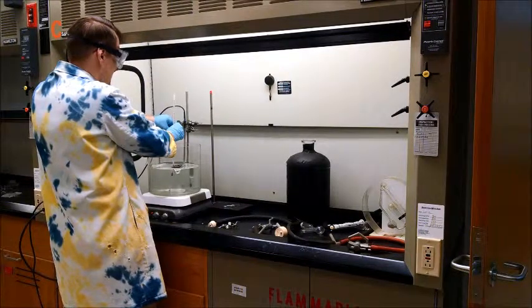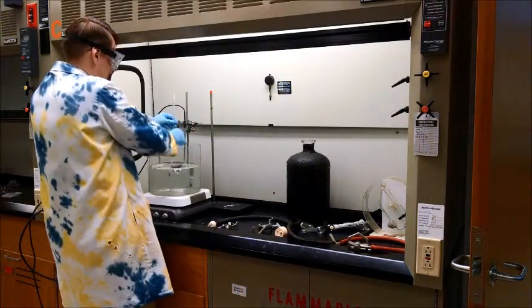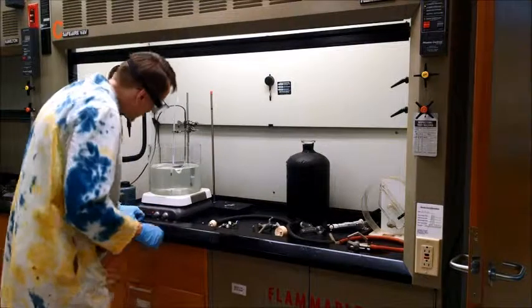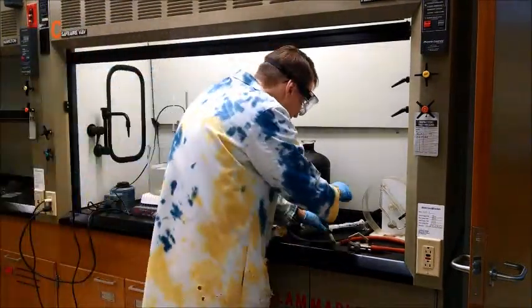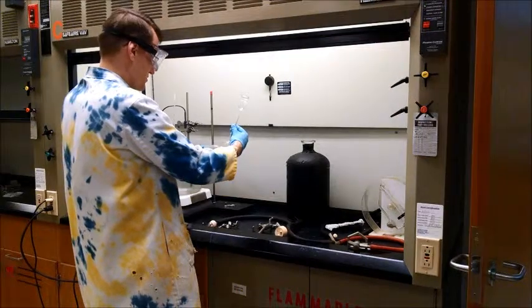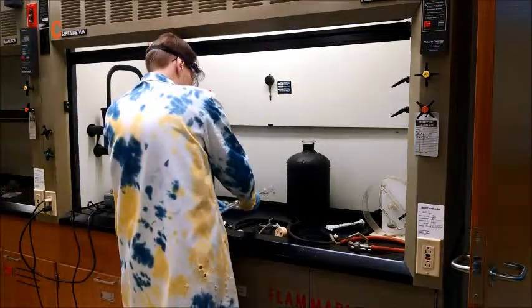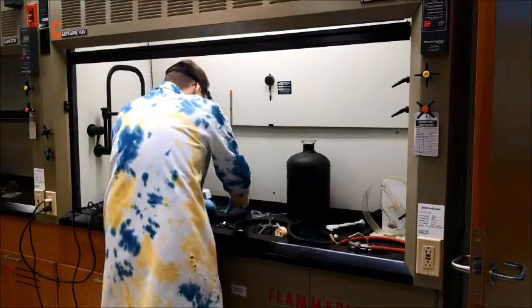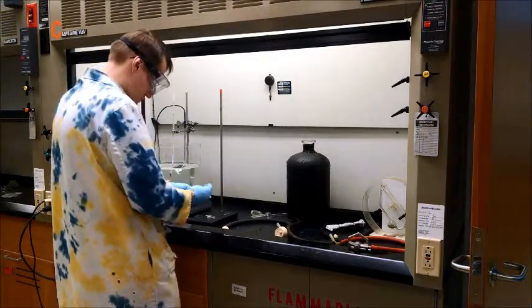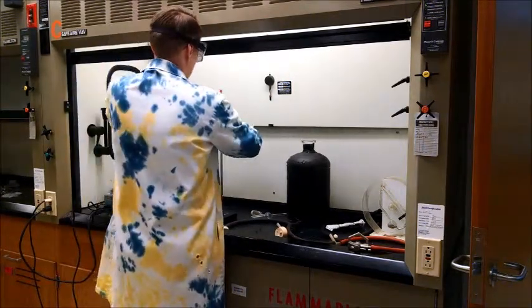We're going to clamp the thermometer so that it's out of the way of the glass stir bar so it doesn't get damaged. The bulb is fully immersed into the water. The isotenscope here is a special apparatus — we cannot buy a new one, so we want to be very careful not to break this one. We're going to clamp it in here, moving our ring stand and attaching our clamp.